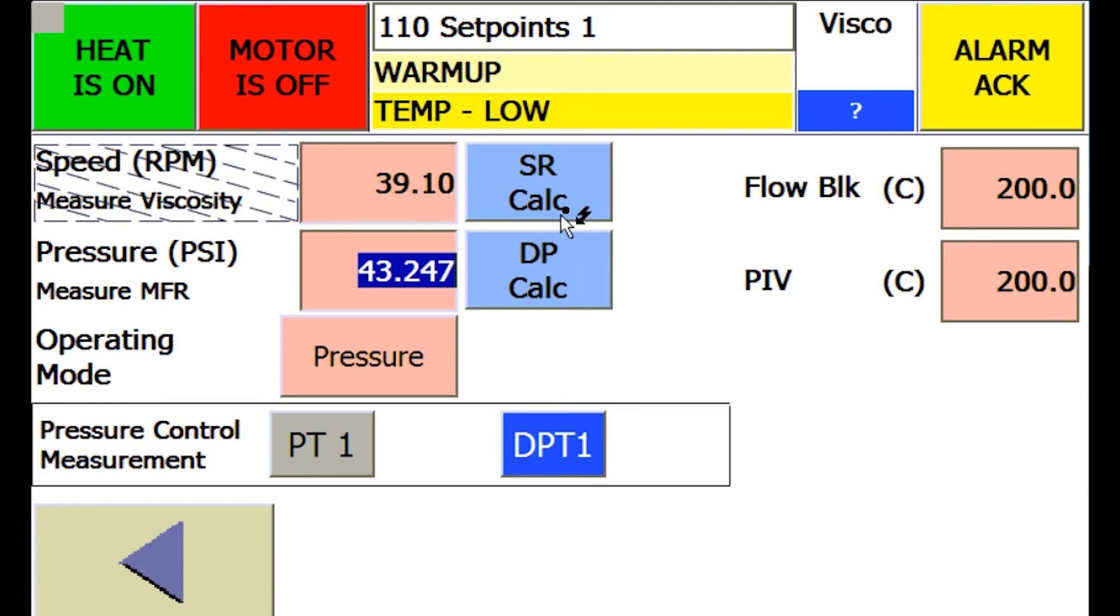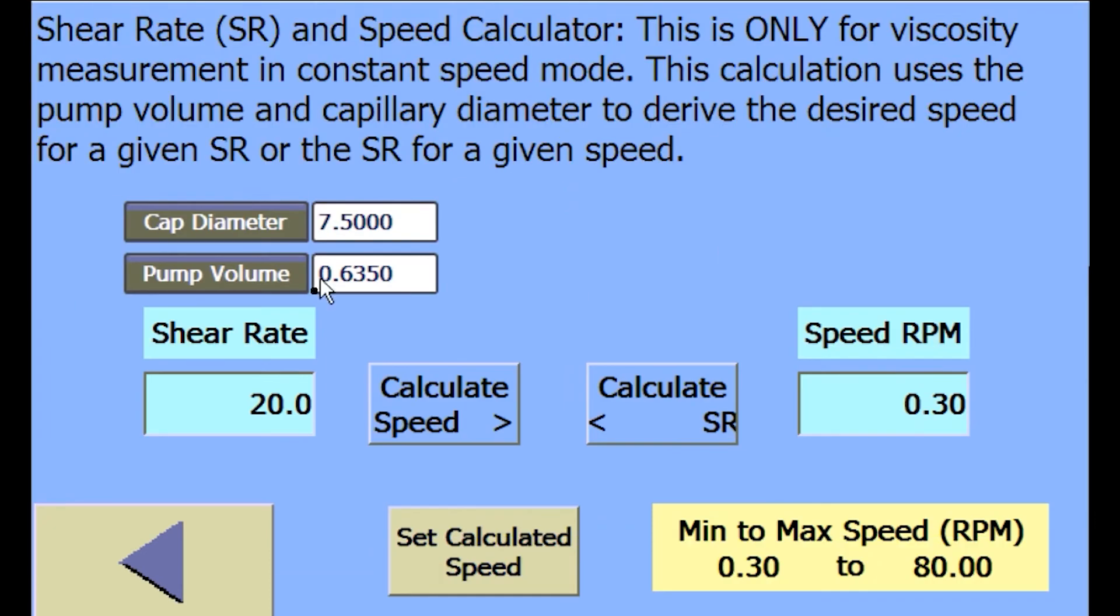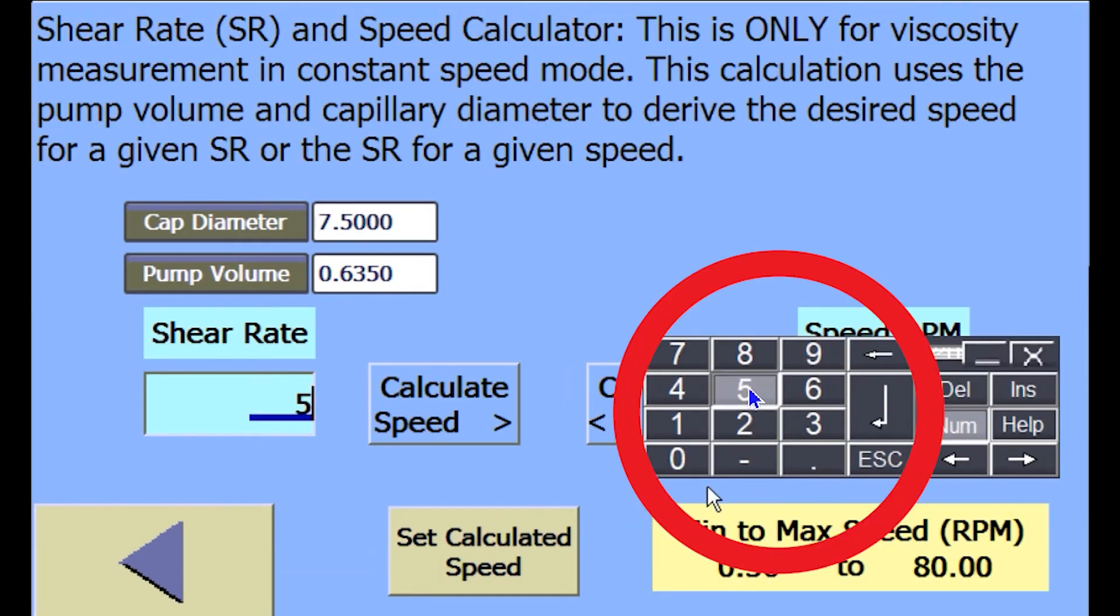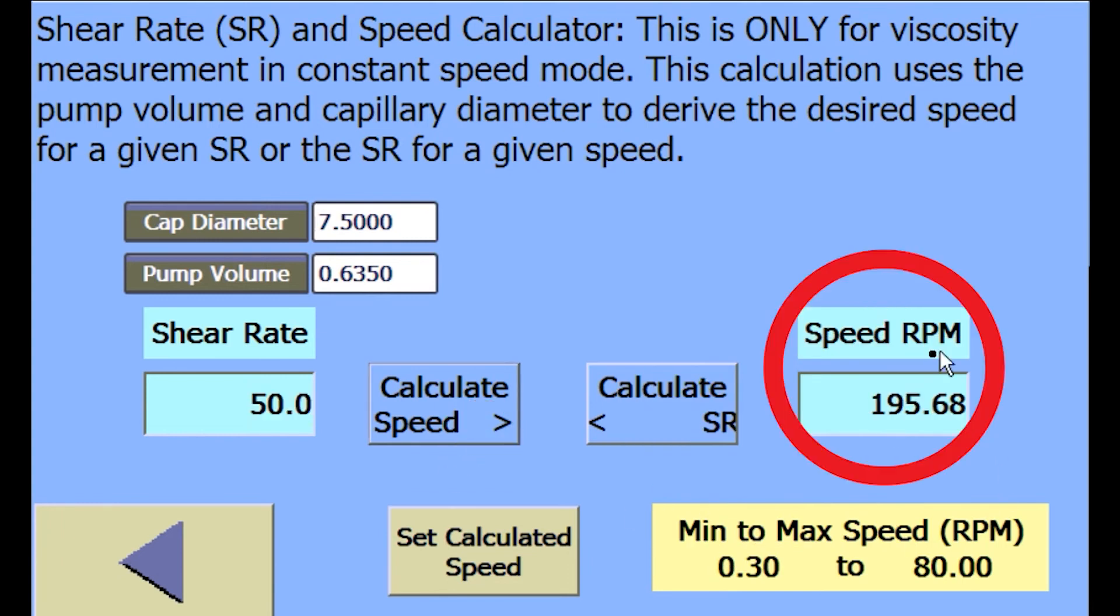For shear rate to speed calculations, press the SR calc button and enter the desired shear rate you would like the instrument to process your material. Press the calculate speed button and the speed set point will appear on the right.